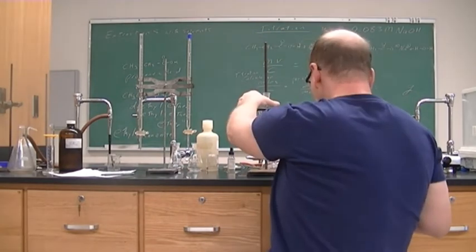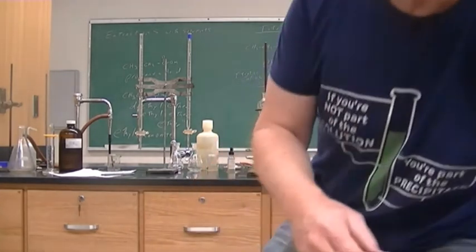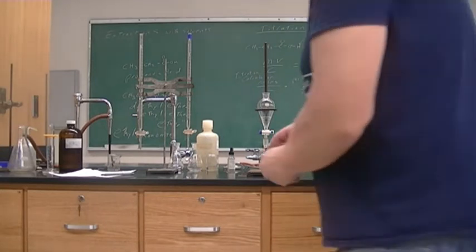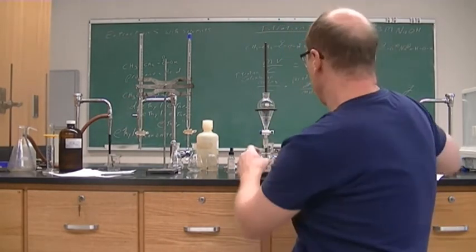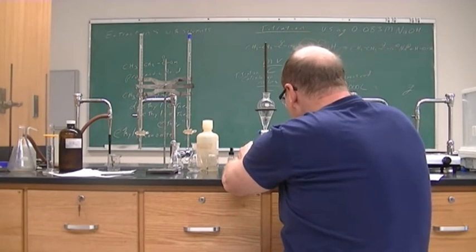I will get another beaker. Now I'm going to put it in a beaker and not an Erlenmeyer flask because I'm going to pour it back in here. So that was just the first of 3 extractions. And so I'm going to take this out.